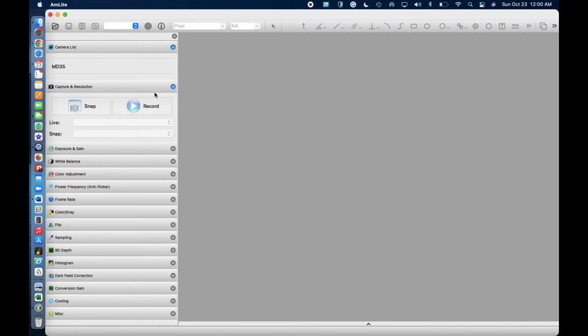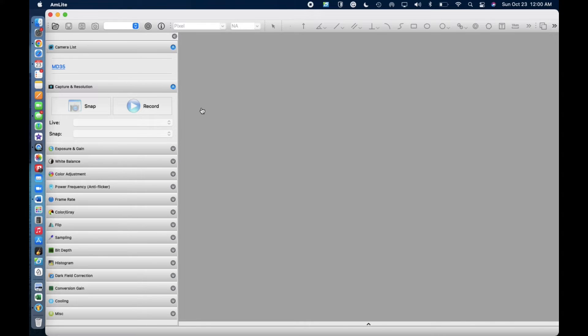So you'll see how it'll look. You'll want to click on the MD35 to select your camera.